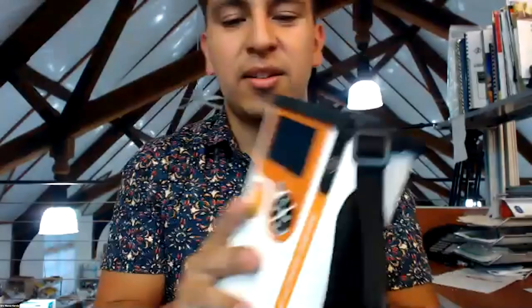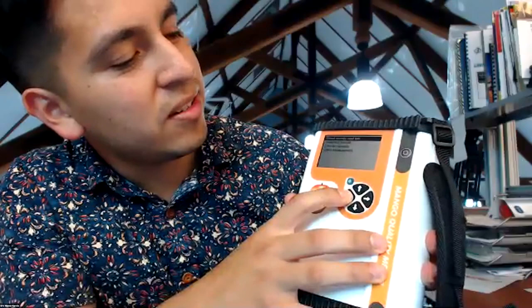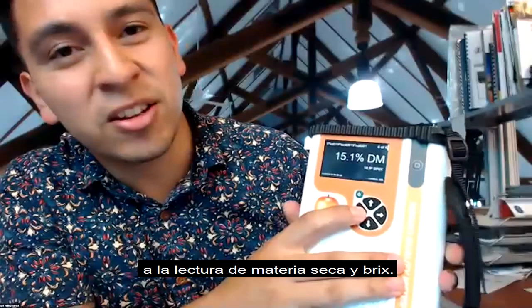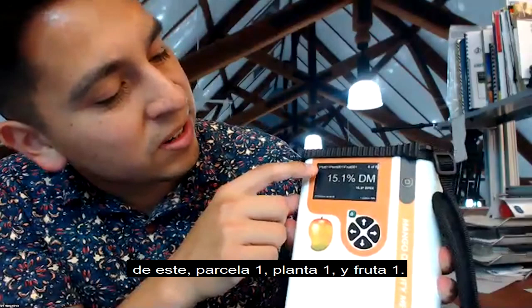You can organize these measurements by pushing the right button. It'll save to a recently used lot. You can select lots from your list, or you can enter a new one. You can also delete the measurement. If you push left, it'll take you back to the dry matter and brix reading. Up top on the screen, it'll give you the organizational tree. This one is in plot 1, plant 1, and fruit 1.